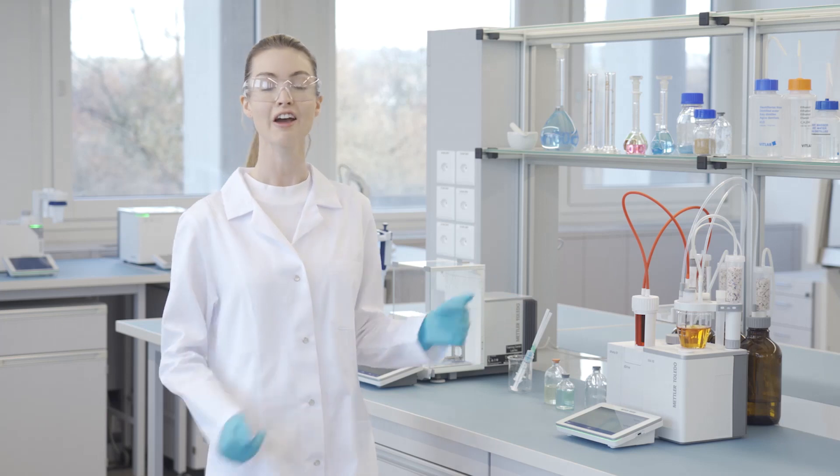Hi, I'm Amanda. I'd like to introduce you to the METTLER TOLEDO EVA Volumetric Karl Fischer Titrator, the solution that speeds up your water content determination.